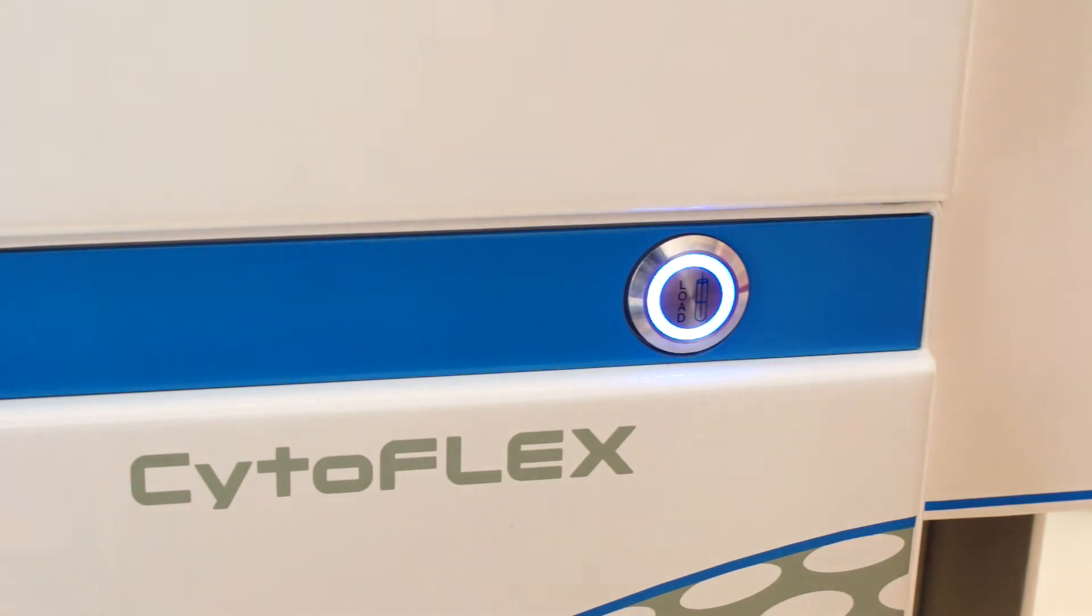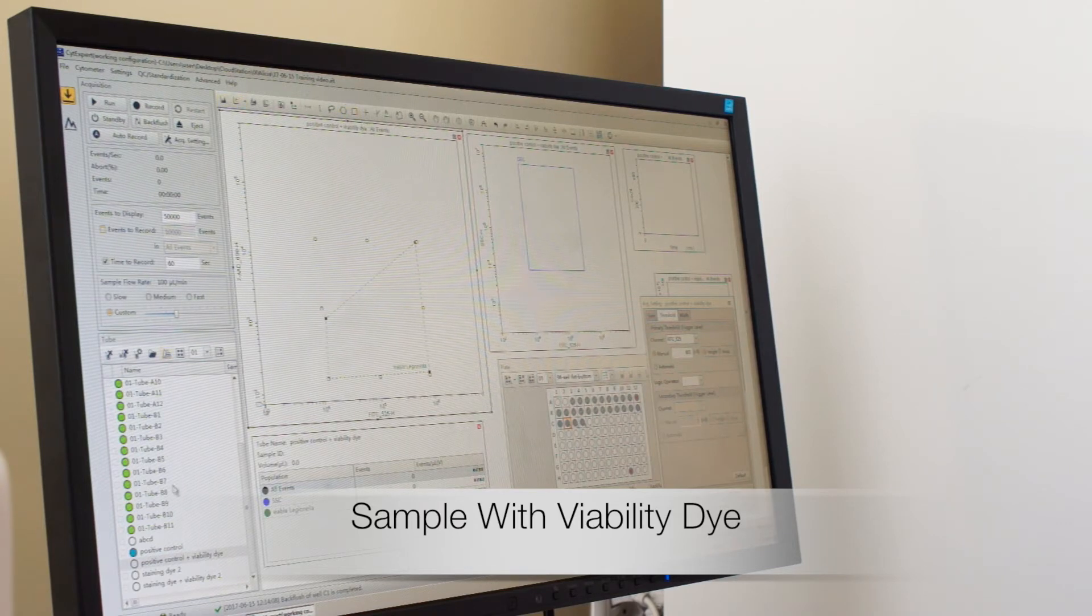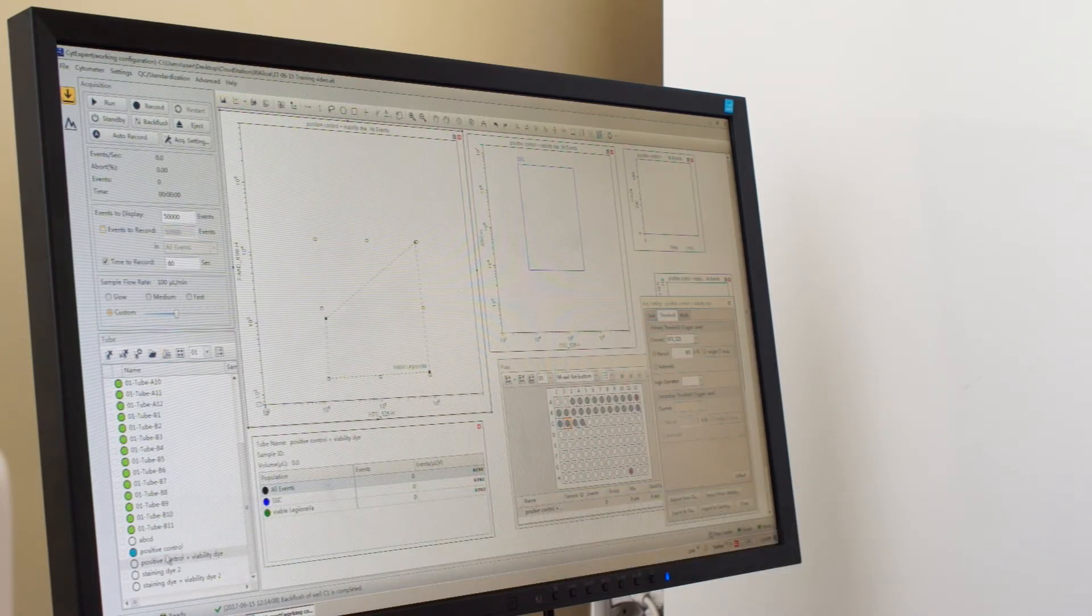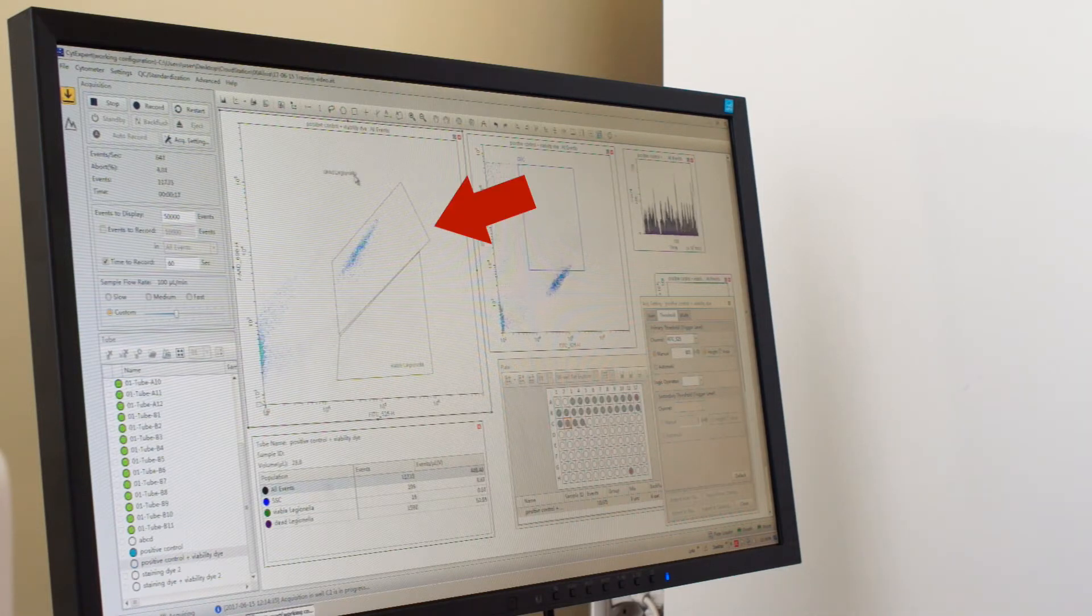Now I am looking at the sample that I additionally stained with the red viability dye. This red dye only stains dead cells. The viable fraction that is stained only green is here. The population of dead Legionella cells you can see here.